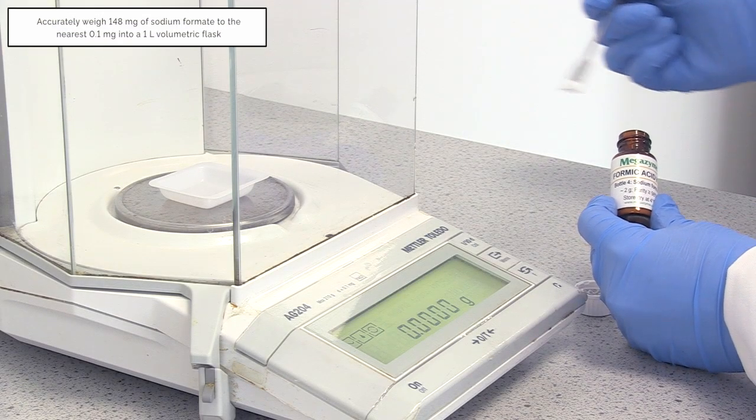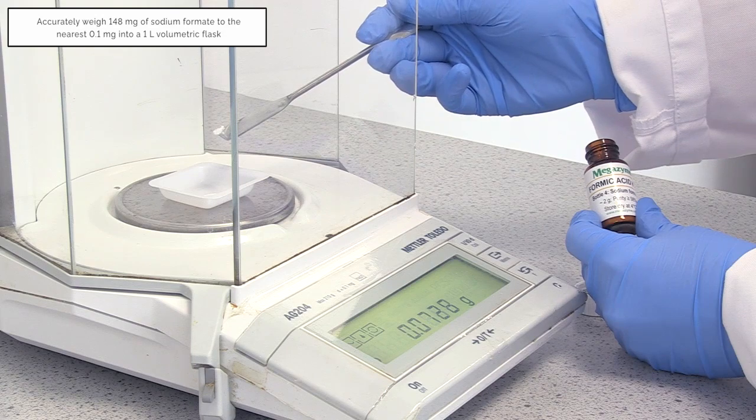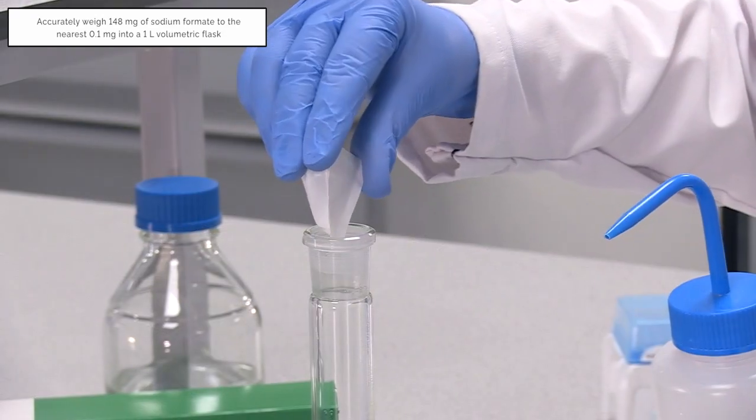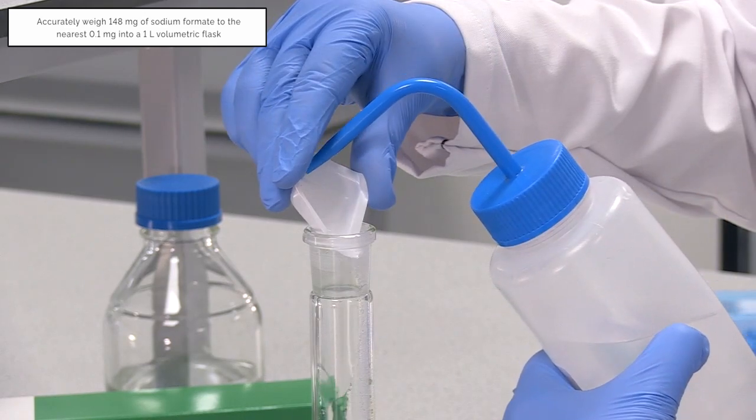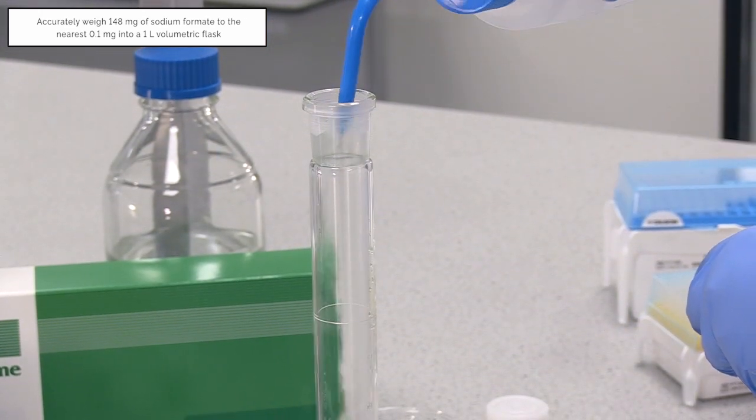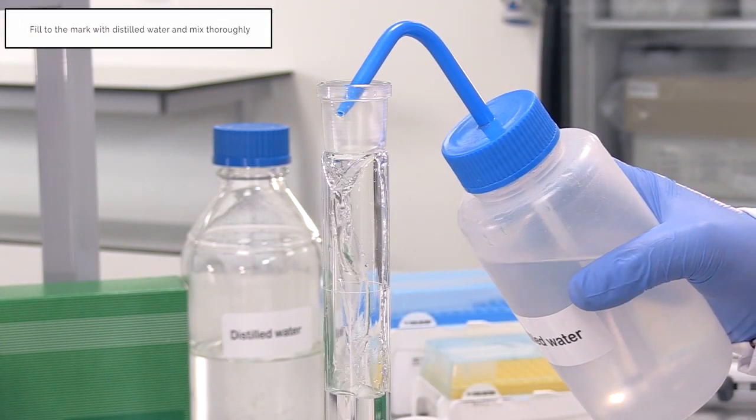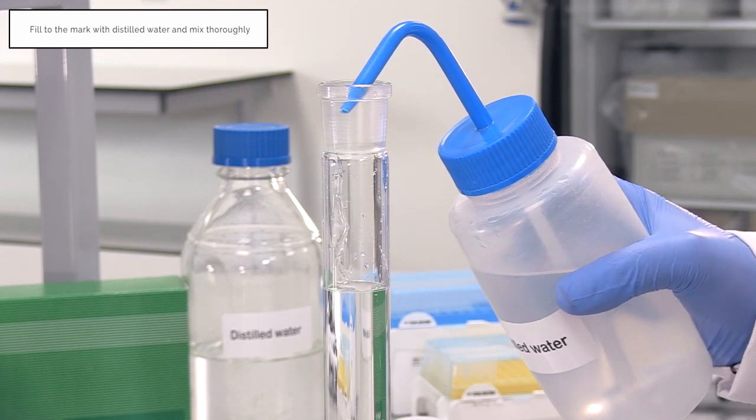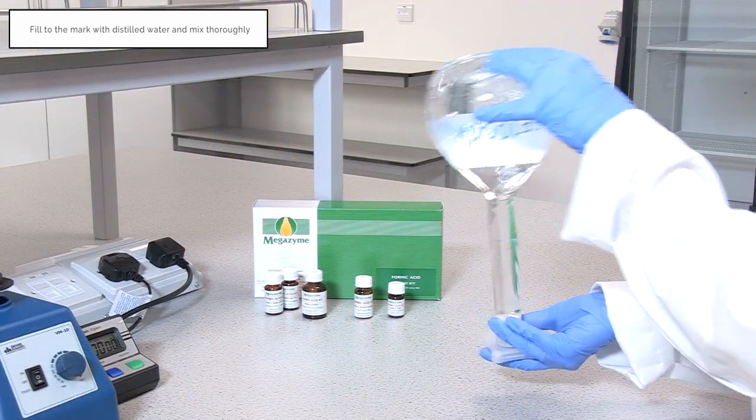Accurately weigh 148 mg of sodium formate to the nearest 0.1 mg into a 1 litre volumetric flask. Fill to the mark with distilled water and mix thoroughly. This corresponds to 0.1 g per litre formic acid.